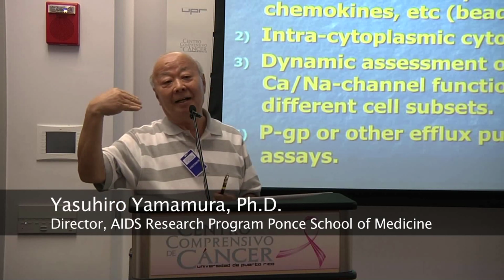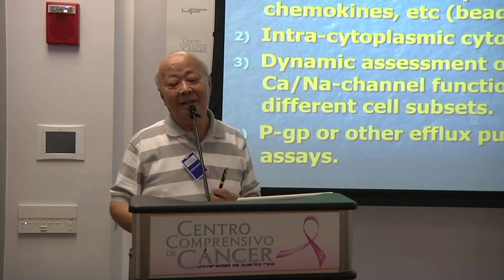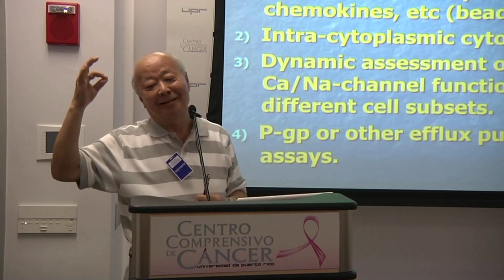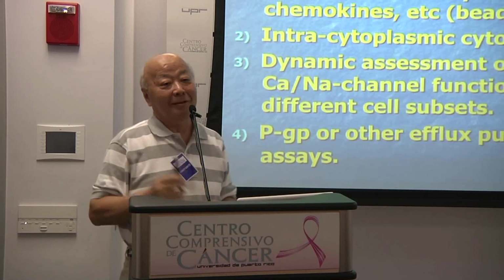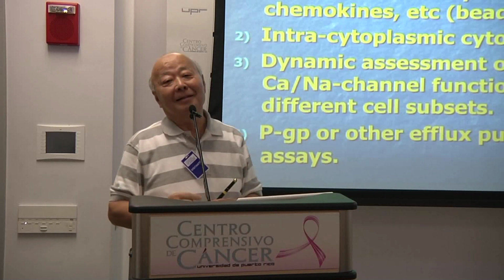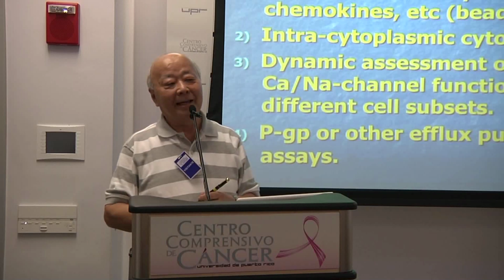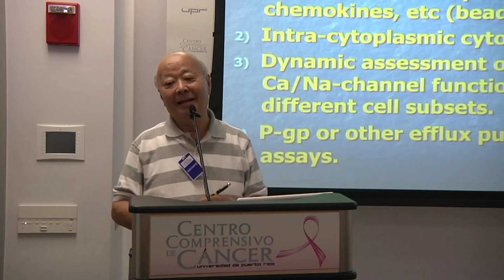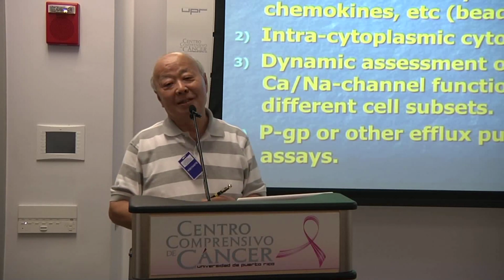And as a part of bragging, I may add again, since we take the ACTG panel annually, we get the test results of all the participating laboratories, including national and international ACTG labs. I will not point out the names, but we find very interestingly, some of the big name institutions using FDA approved kits do not always pass.